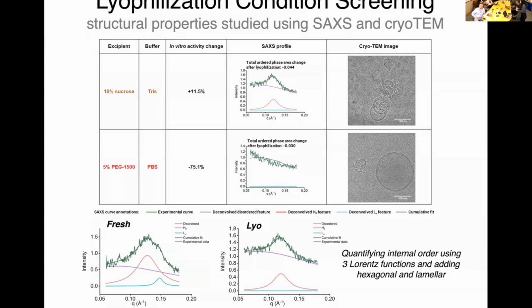And relative to protein SAXS, these are going to be heterogeneous, right? You're going to have different sizes, different things, so not pure one thing. It's a little more complicated. Each of them isn't identical necessarily. So we have it easier. Yes, the lamella should be pretty consistent. Although if you use different lipids, it does also matter, because if the lipid bilayer size is different, then that will also change.